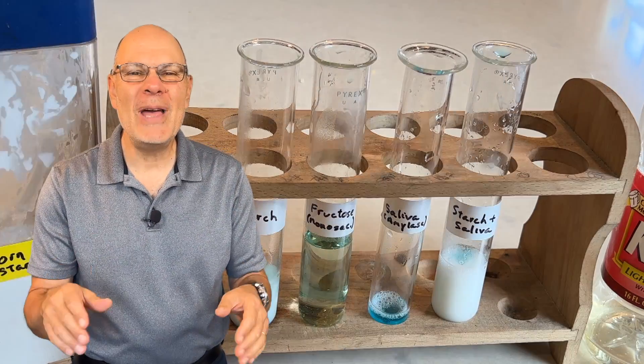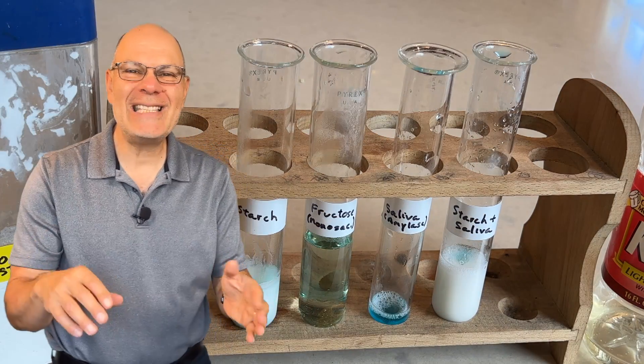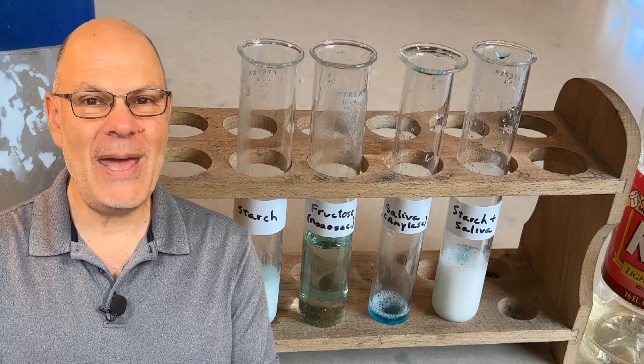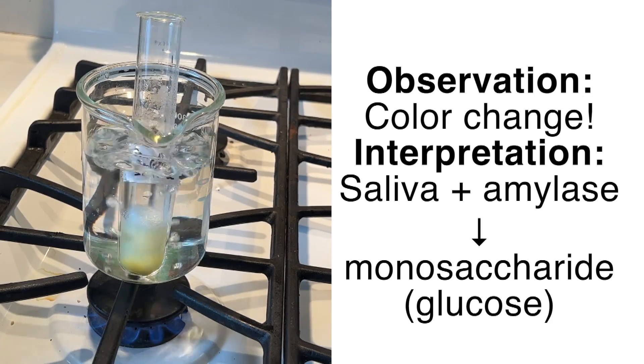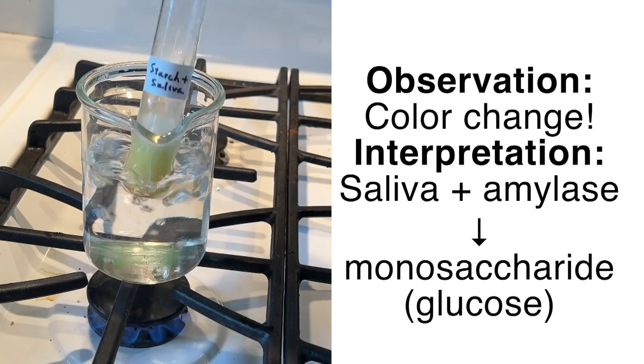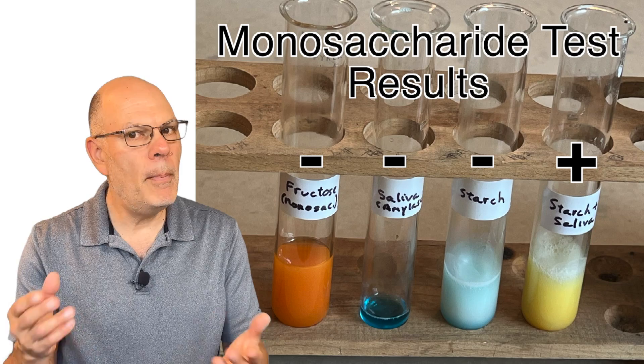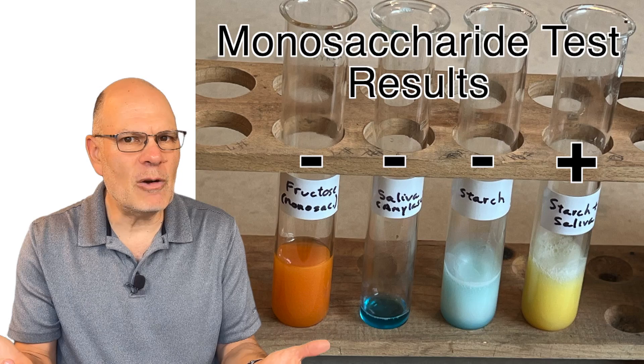And now for the moment we've been waiting for. Let's test the test tube that has a mixture of starch and saliva. We add the Benedict's. It's blue. We heat it up, and look, there's a color change that indicates the presence of a monosaccharide. But where did that monosaccharide come from?